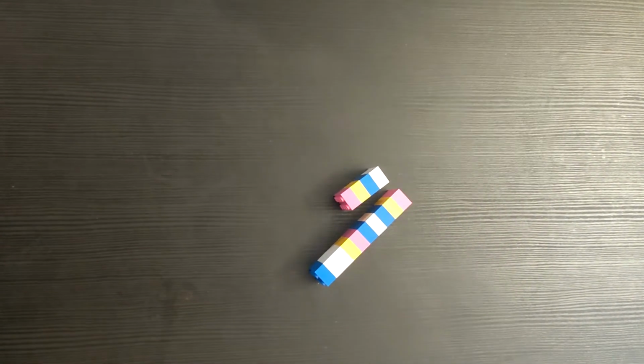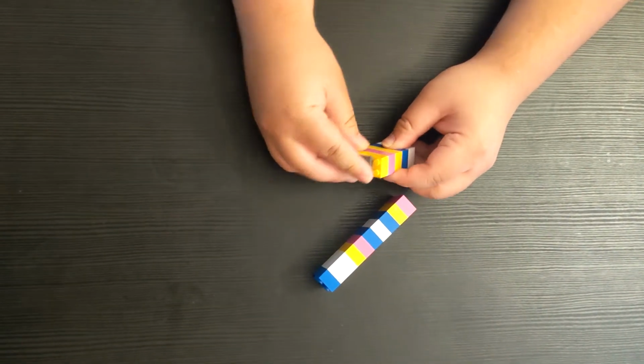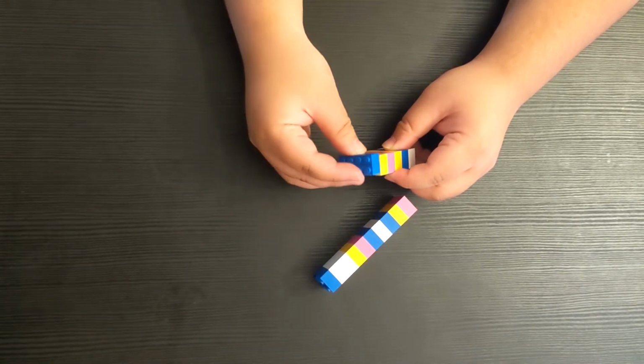Huh? In terms of the Lego analogy, it's like you have a long chain of nucleotides. That's the template strand, and you match the corresponding color next to it. You keep adding the Legos, but at some point, no more Legos can be stacked. Once you have all your Lego chains of different sizes, they can be ordered according to their length.